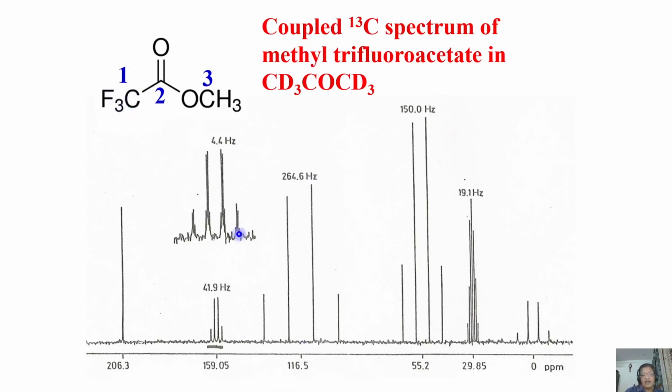This is a well dispersed quartet with large separation of the 4 peaks. If you measure the separation of any two adjacent peaks, it gives you the J coupling. This separation is quite large. Because of the separation and the quartet pattern, and because it is at the downfield, this must be CF3. So this is the first assignment.